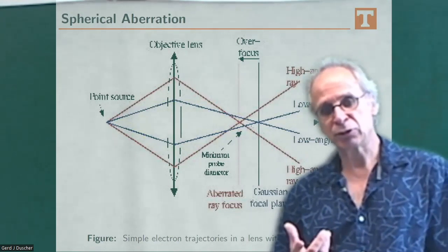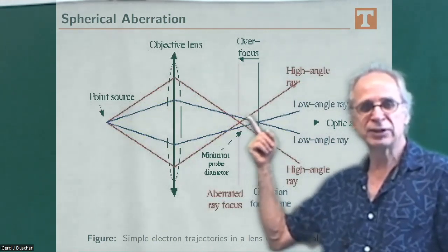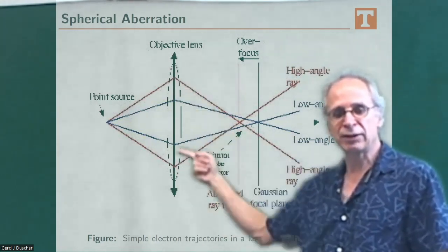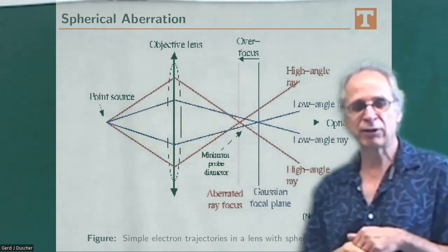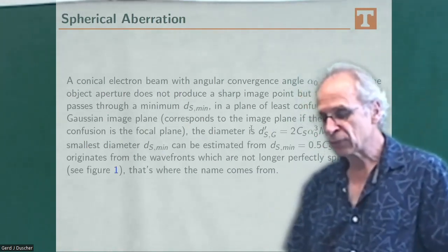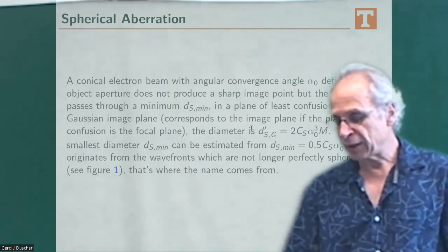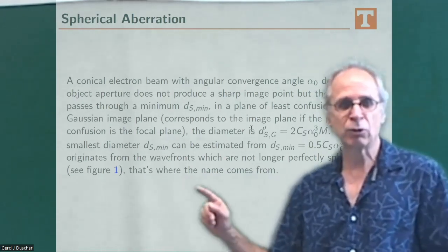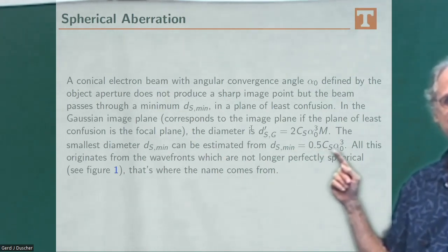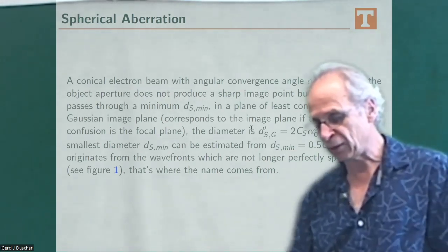And so the Scherzer focus and the transfer function discussion, depending on that, will give you the smallest disk of confusion. And you can already see that it depends highly on what kind of diffraction angles you get through your lens. Then the whole mathematics goes accordingly, but the minimum disk, the disk of least confusion, is then half times the spherical aberration, and it is dependent on the maximum angles that you allow to get through.